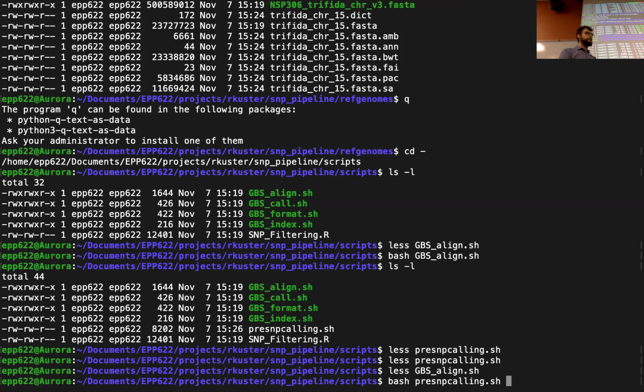But at the end of your analysis, you want to go back, and we did this in the first class, where we demultiplexed. We actually did a for loop going from 1 to 24, and 1 to 16 for the reverse. Then at the end of that process, we assign each number to the sample. So imagine if you had a file with a serial number 1 to 24, and that serial number matches the sample.